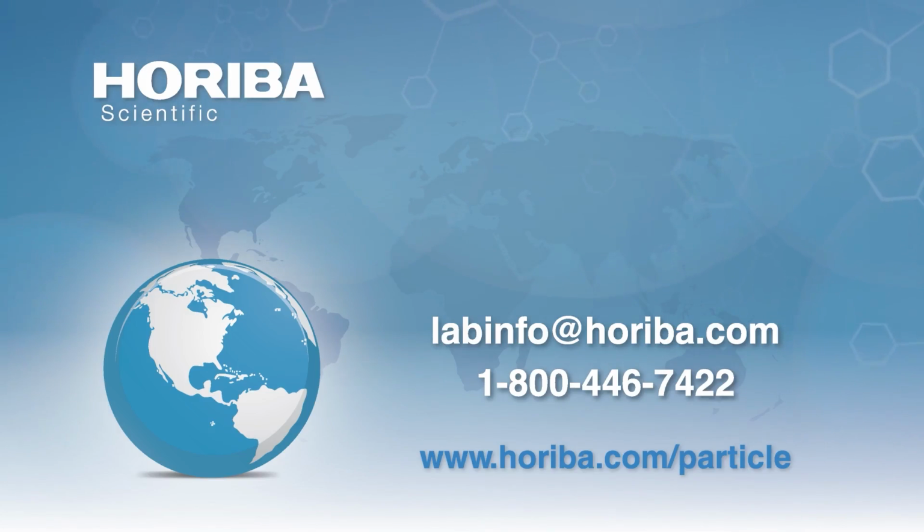I would add though, if you're looking at virus, likely you would be interested in particle count, the number of virus per ml or in a given volume. So we do have a different technique called the multi-laser NTA that may be more suitable in tackling applications like virus than sedimentation.